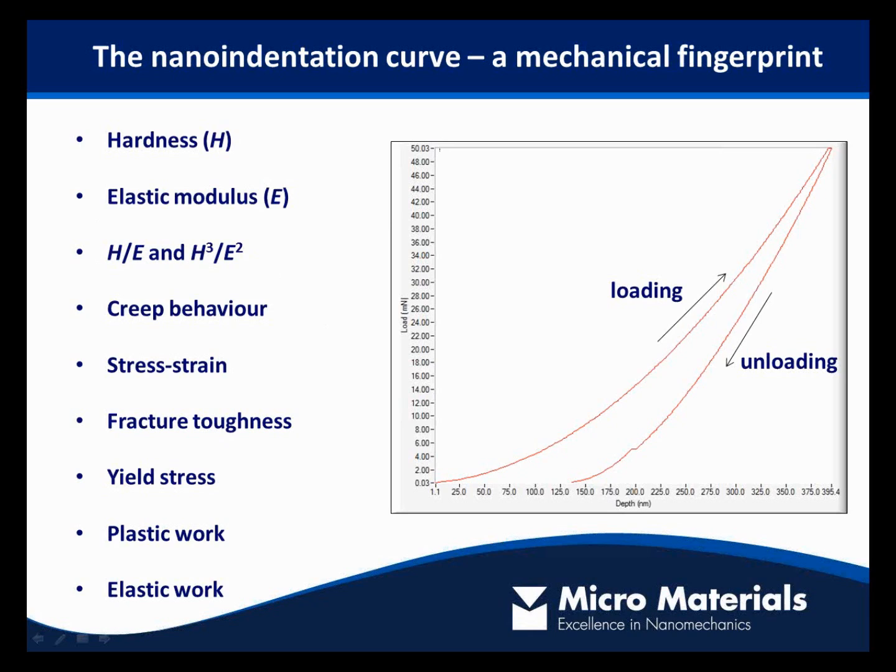If we are testing a soft metal, in contrast, we would get very little elastic recovery, and that's because there's a much smaller ratio of hardness to stiffness in those materials. So materials such as copper or aluminium have a much lower hardness modulus ratio, and that affects their tribological behavior.